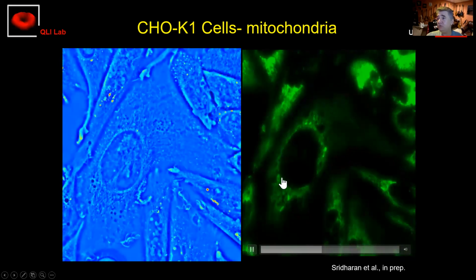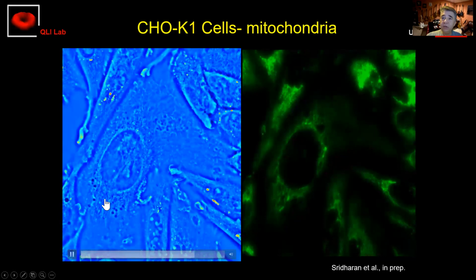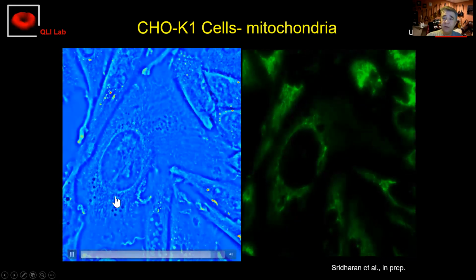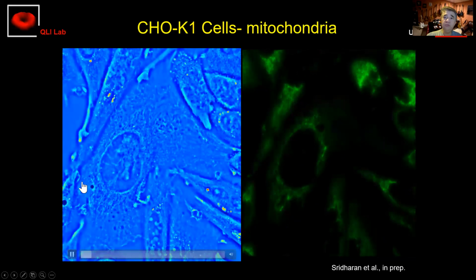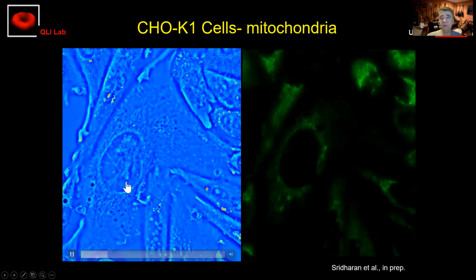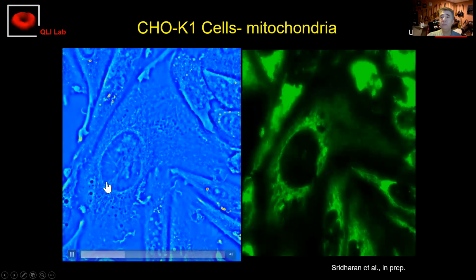In this case, you see how the mitochondria look, and you can go and recognize in the SLIM image that these little sausages are in fact mitochondria. So you can in principle create a digital map from the fluorescence and use it back in the SLIM to get phase information and density information straight from the SLIM image.